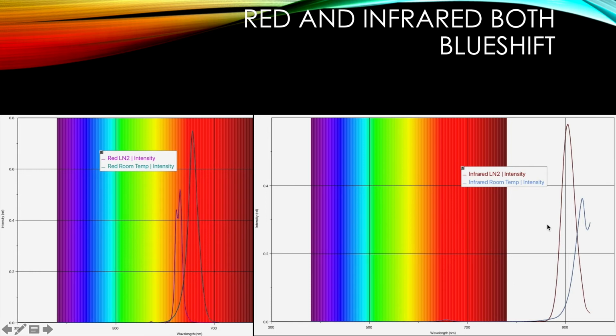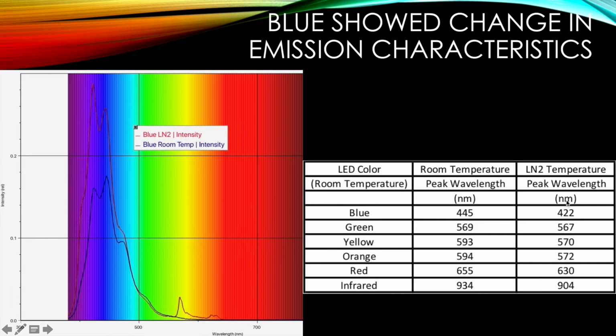And then in the infrared, even though you can't see it, I was using an iPhone which has a filter on it that filters out infrared, so you couldn't see it in the video. Some video cameras will show infrared. But it definitely shifted it, but not to the visible. And so it started here and then shifted here.